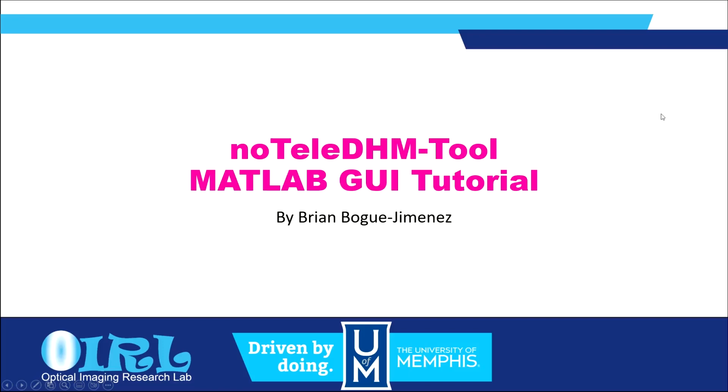Hello, my name is Brian Bogue, and in this video I will be guiding you through the installation and use of our non-telecentric DHM reconstruction tool using our custom MATLAB application and user interface. So let's get right into it.